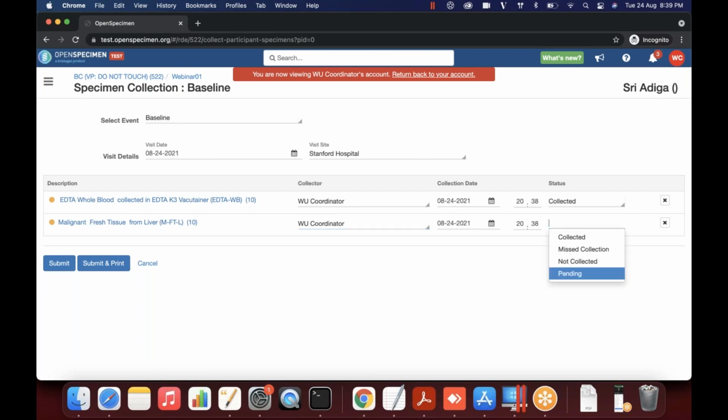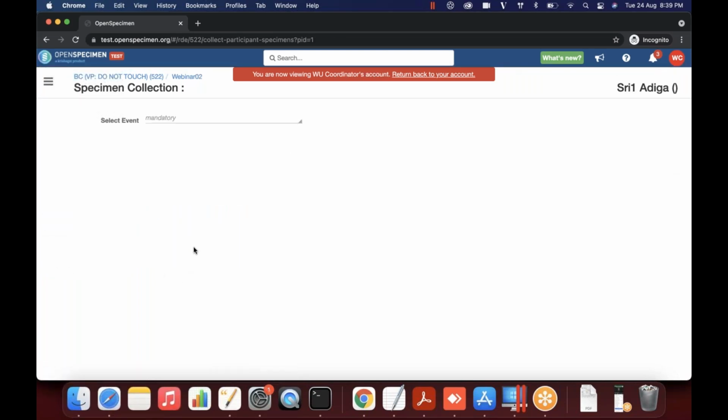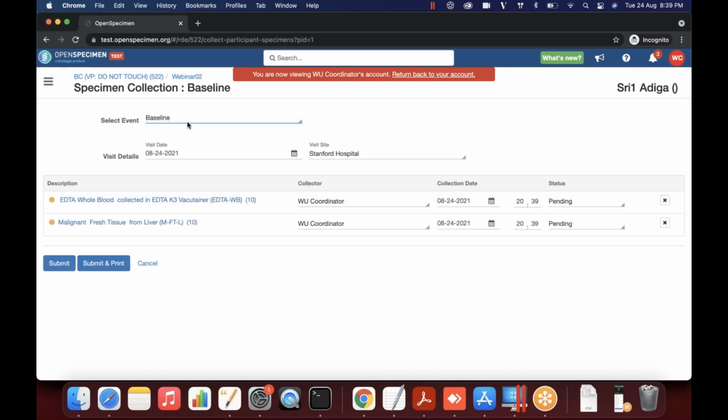So I can say collected, and for this patient I'll just do submit, and in the next case I'll do submit and print. So you see here now I'm done with patient 1. Now I'm doing patient 2. Again, you see here webinar 2, and I can go again for baseline, and I can select one as this one, the other as missed.